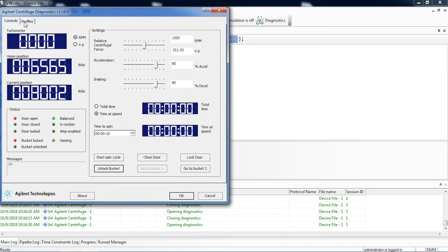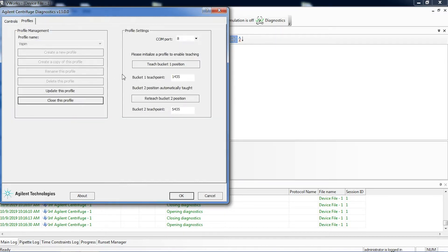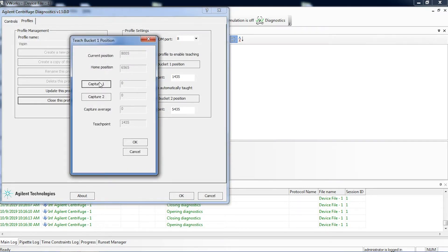Once you've manually aligned the bucket, go back to profile, click on teach bucket position 1, and then capture 1 and capture 2.